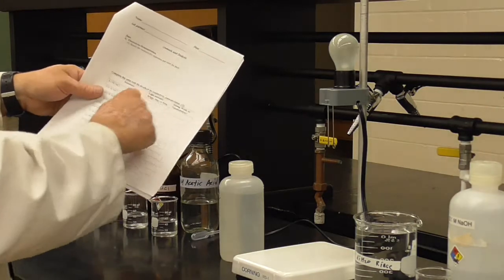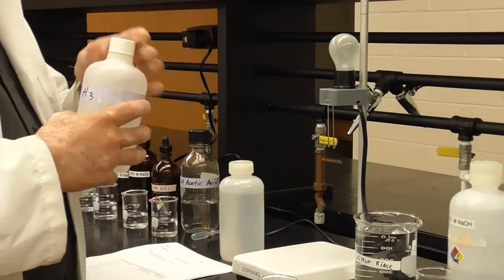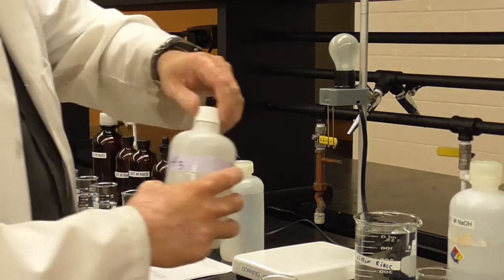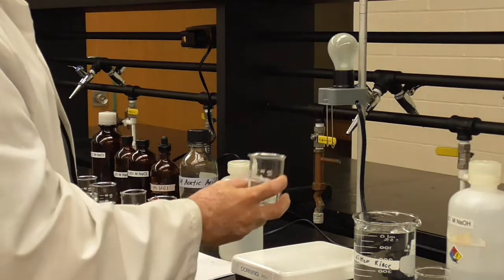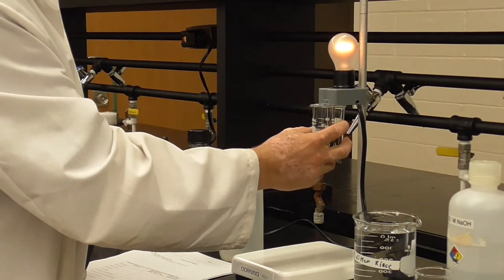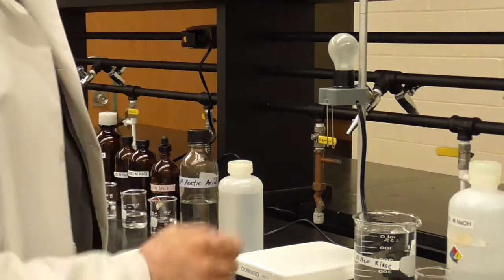All right, so we're about halfway through the list. Next is ammonium hydroxide, so ammonia. This is the stuff that's in Windex, cleaner. 0.1 molar again, so we're keeping the concentration the same each time. We're just varying what the chemical is. Okay, here we go. 0.1 molar ammonium. A little bit. Not super bright, but it is conducting it. So again, you can classify that as either a strong electrolyte, a weak electrolyte, or a non-electrolyte. That's up to you to figure out.